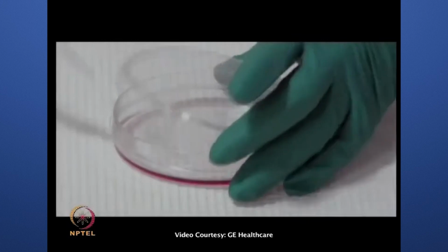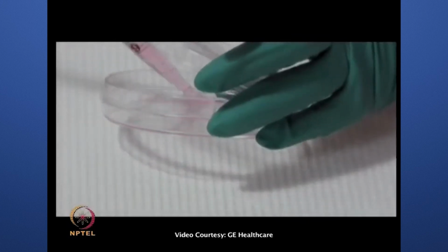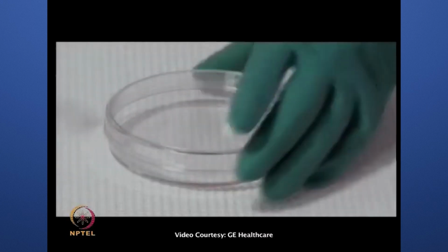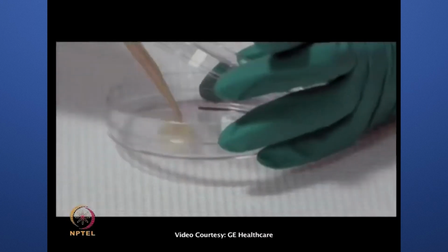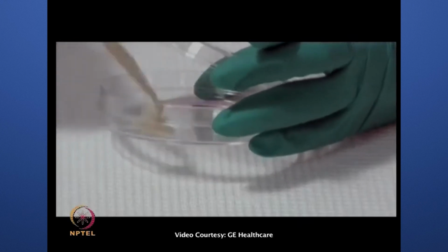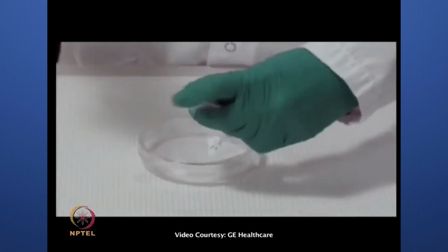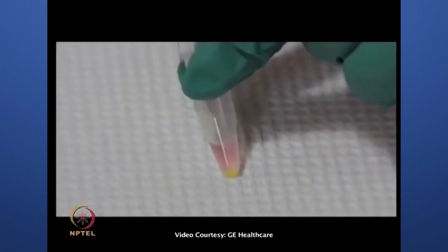Adherent cells are detached using a non-enzymatic procedure to avoid digestion of the cell surface proteins targeted in this protocol. We used a rubber policeman, but using enzyme-free cell dissociation media is also an option. Count and divide the cell suspensions into aliquots of 5 to 10 million cells per tube.